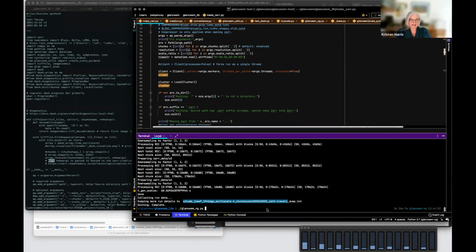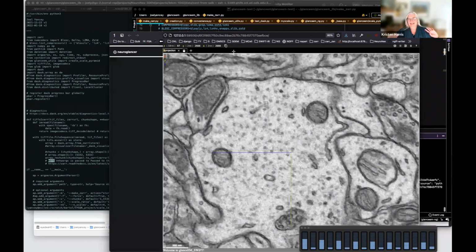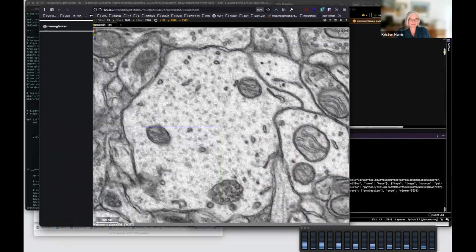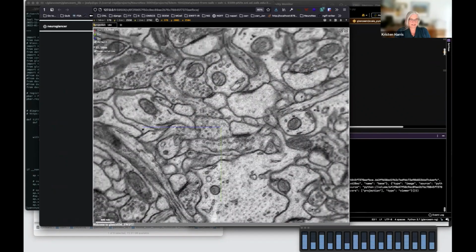I'm glad we didn't have to do any more ground truthing. Although I do have 2 other data sets that have been fully reconstructed. We don't use volume Joseph in the course because it's so big. Oh, I see. I have a series called Oblique that's only 91 sections and has a cylinder in the center of it. It's much smaller than volume Joseph, but everything in it's been reconstructed too. So we're using it to train students to understand what they're doing. It doesn't look very well aligned.